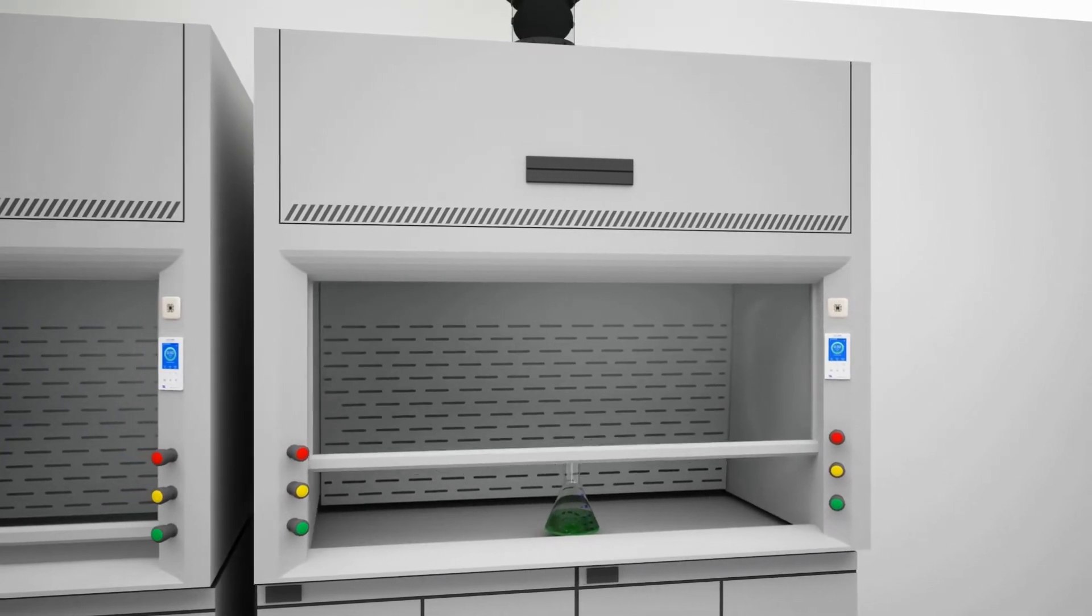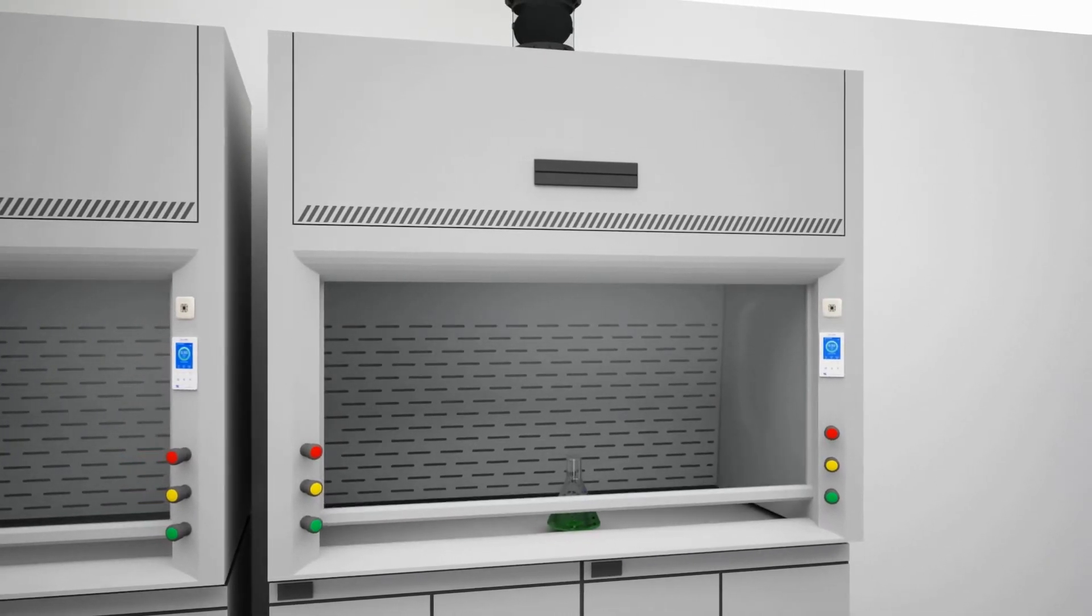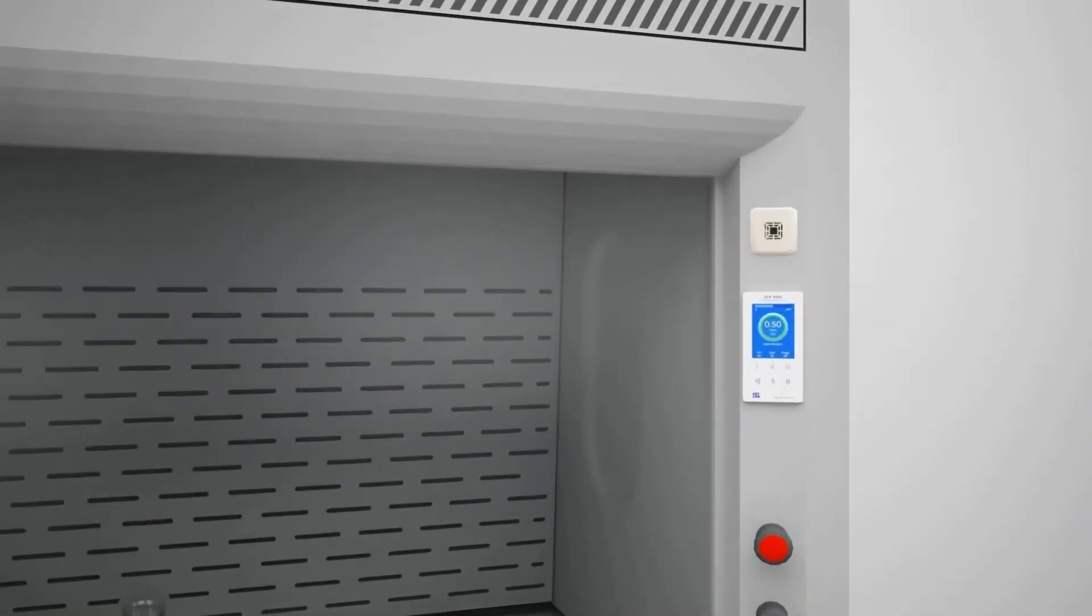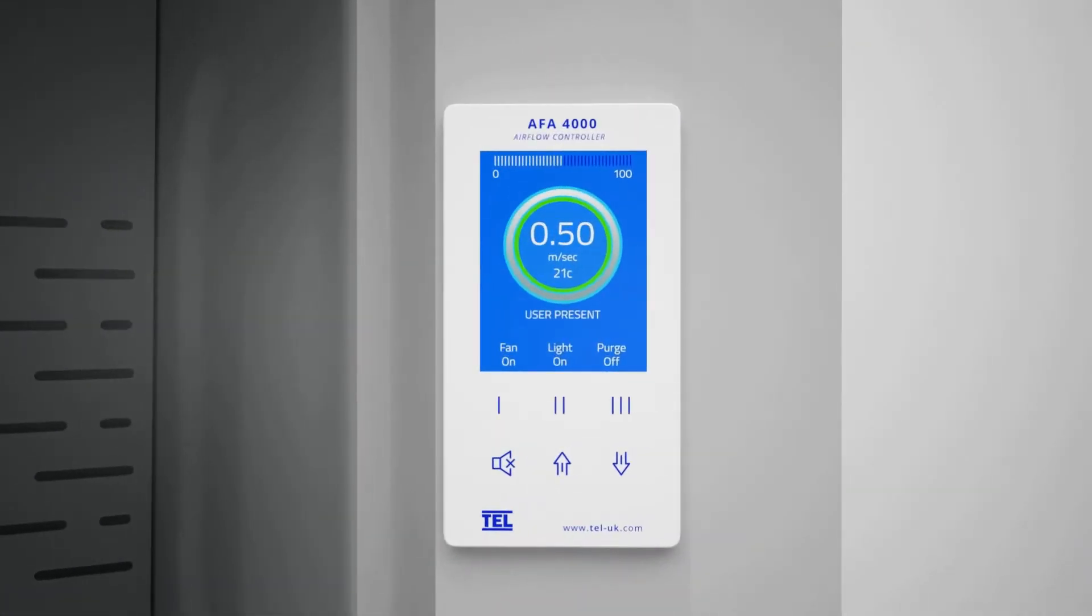By using an automatic sash controller, you can immediately increase the safety of your fume hood operators. However, during times when the operator is present, the sash can be operated manually by the up and down push buttons or by the Tiptronic touch-sensitive feature.